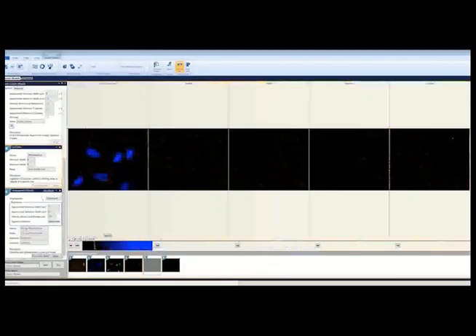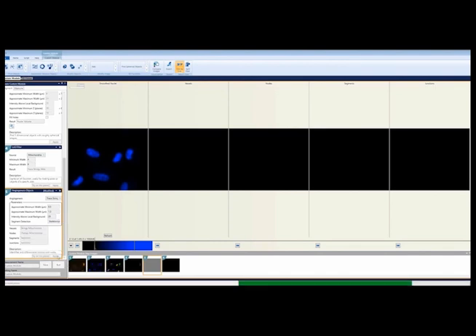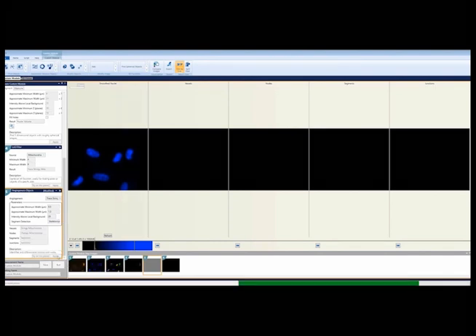Angiogenesis produces 4 masks. The first is a mask of the tubes, which we will be using for the healthy mitochondria. The second is called nodes, which is what we're going to use for clumpy mitochondria. The other 2 are a line along the center of the tubes and a dot at the center of each node, and we won't be using them for this module.